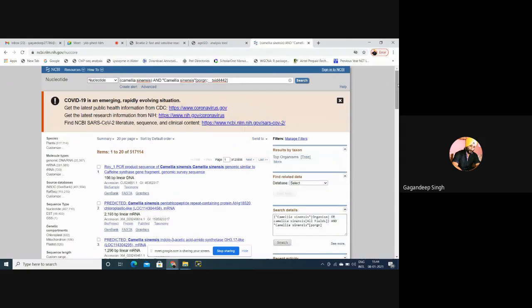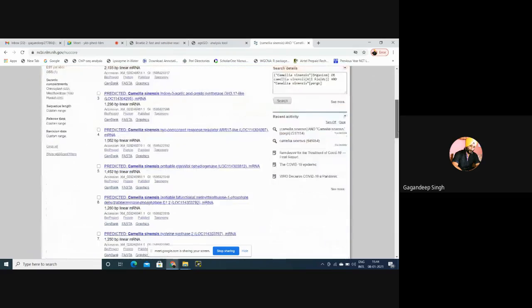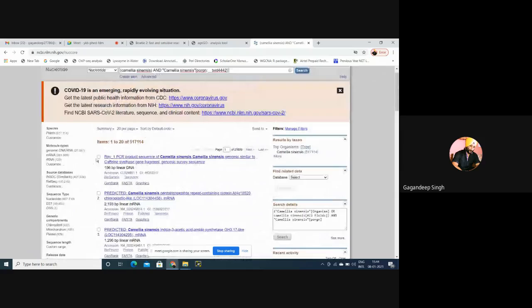So what I'll do, I'll select these 20 sequences just for trial.